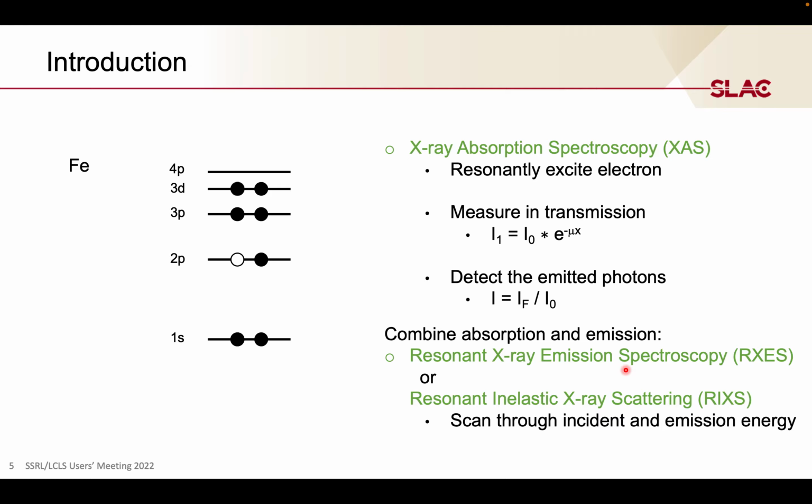It's a little unclear what is what really, so it makes sense if you say, in this case, for example, you would do 1s 2p RIXS. Then everything's clear what you talk about.